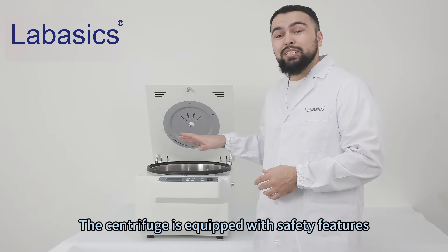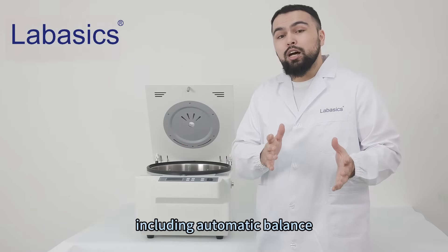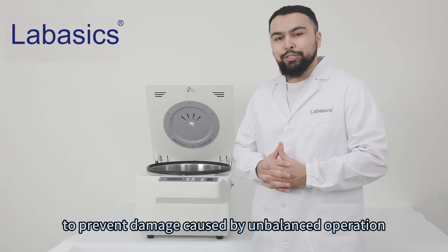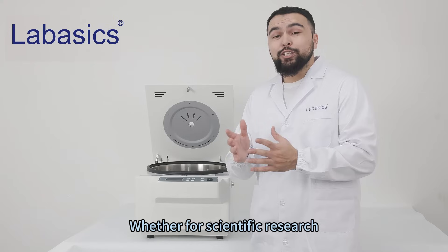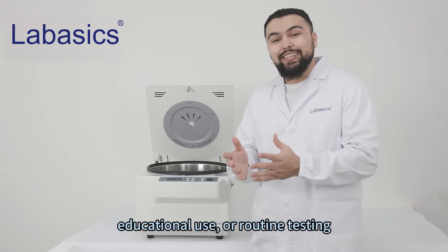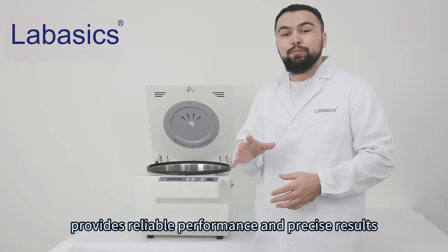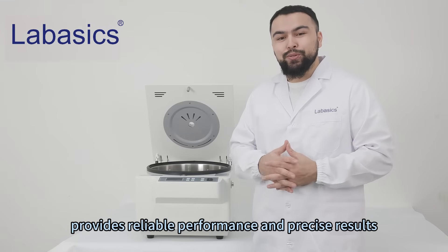The centrifuge is equipped with safety features including automated alerts to prevent damage caused by unbalanced operations. Whether for scientific research, educational use, or routine testing, this low-speed digital centrifuge provides reliable performance and precise results.